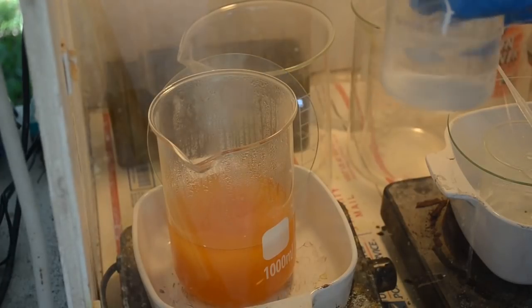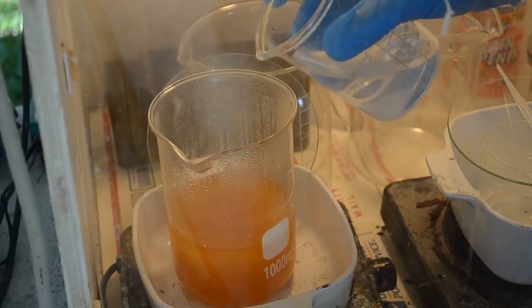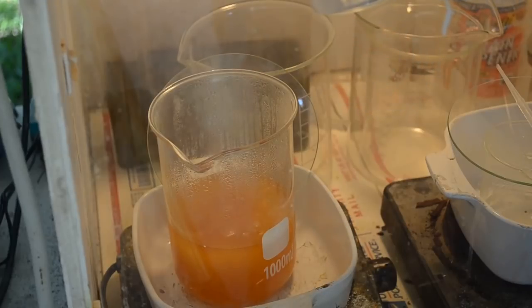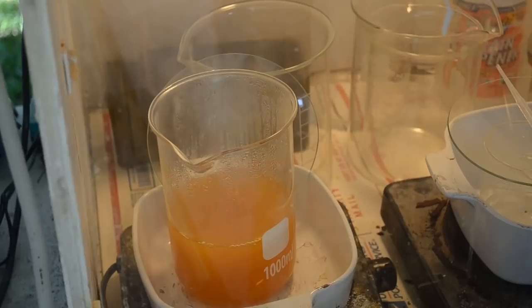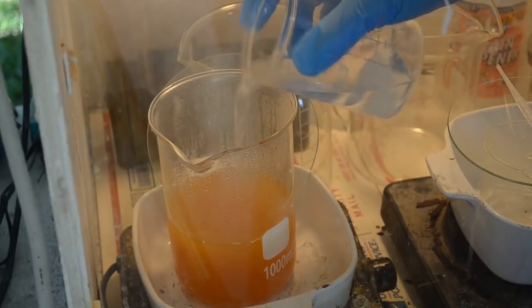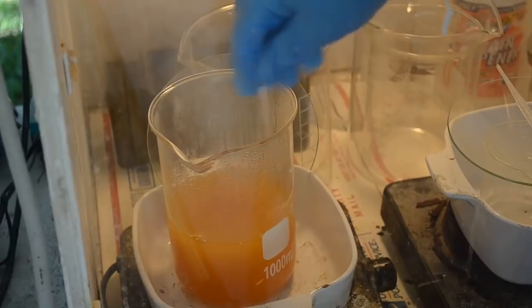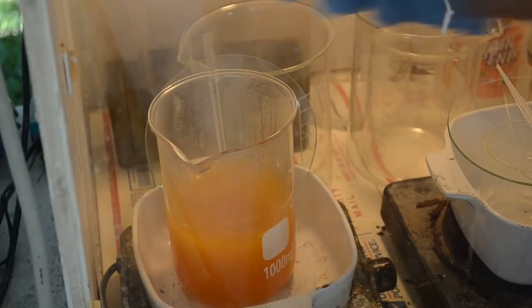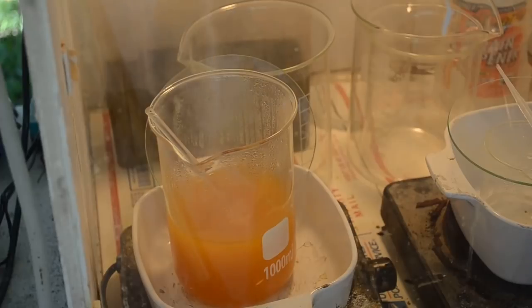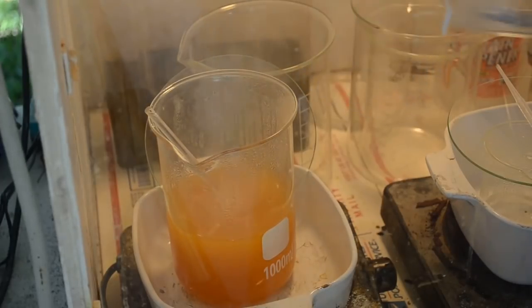Got my usual saturated solution of sulfamic acid here. I'm going to pour it in very slowly. Little bit of bubbling, but not too bad. I guess I must have got the nitric acid pretty close to right this time. Just enough to dissolve the gold, not a lot of extra. Good.